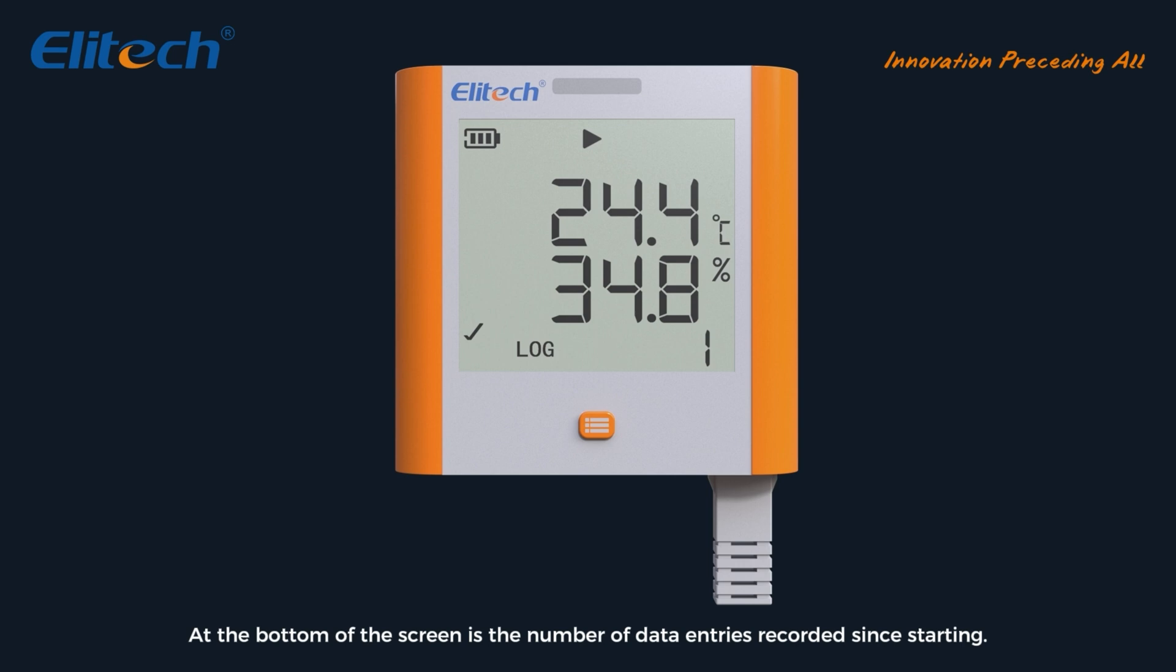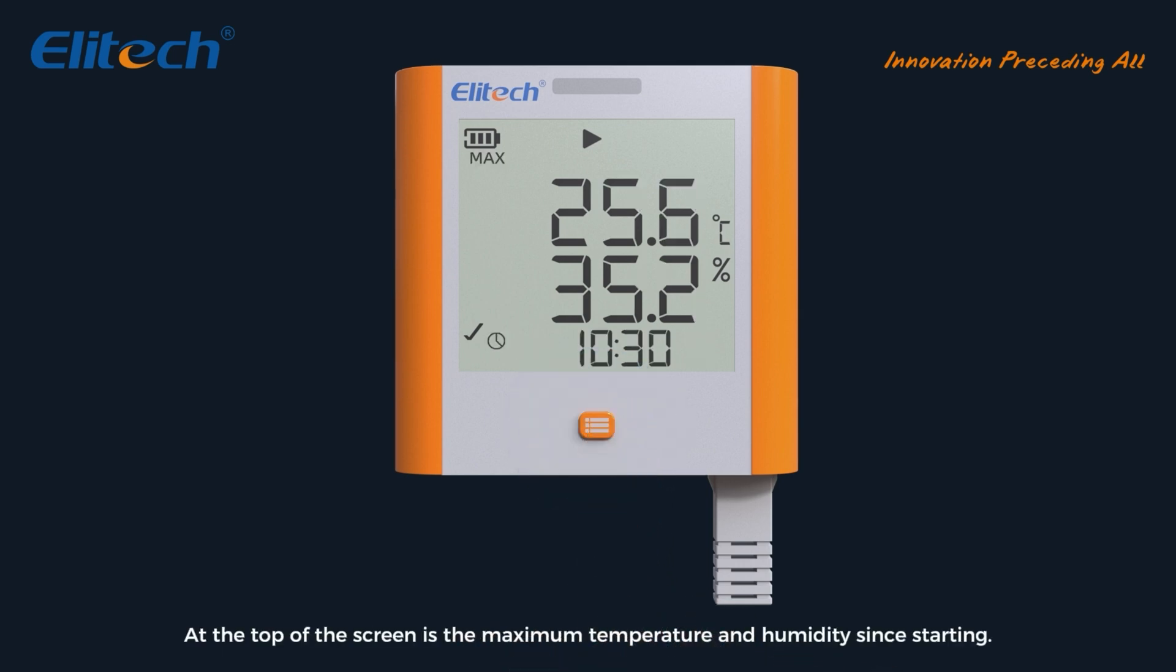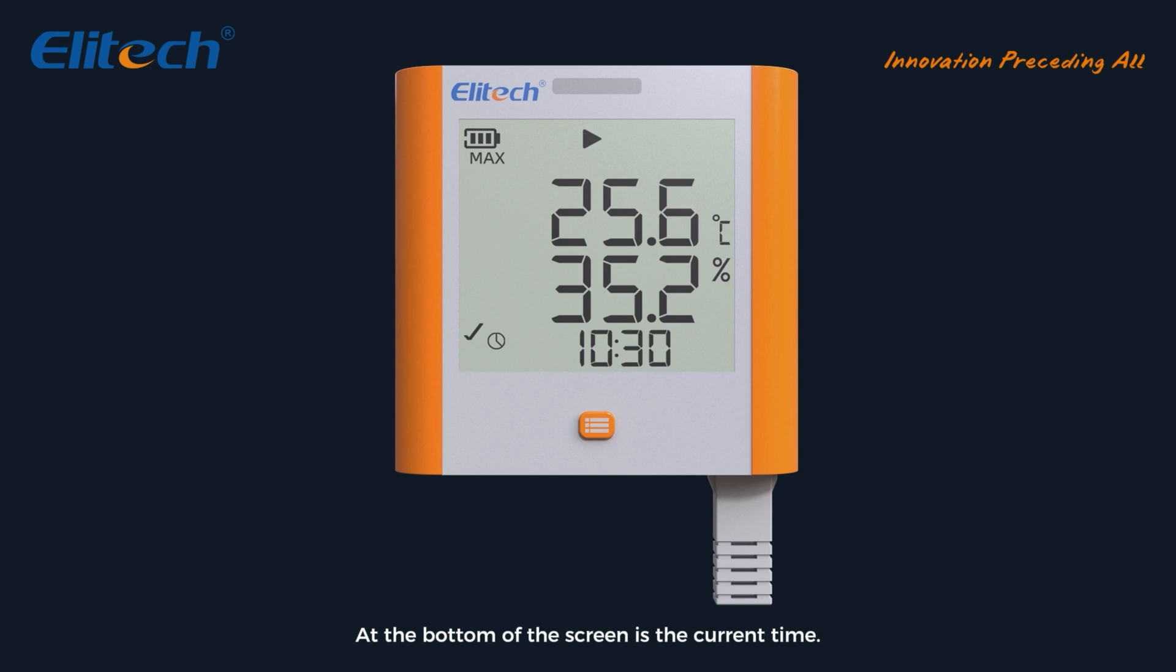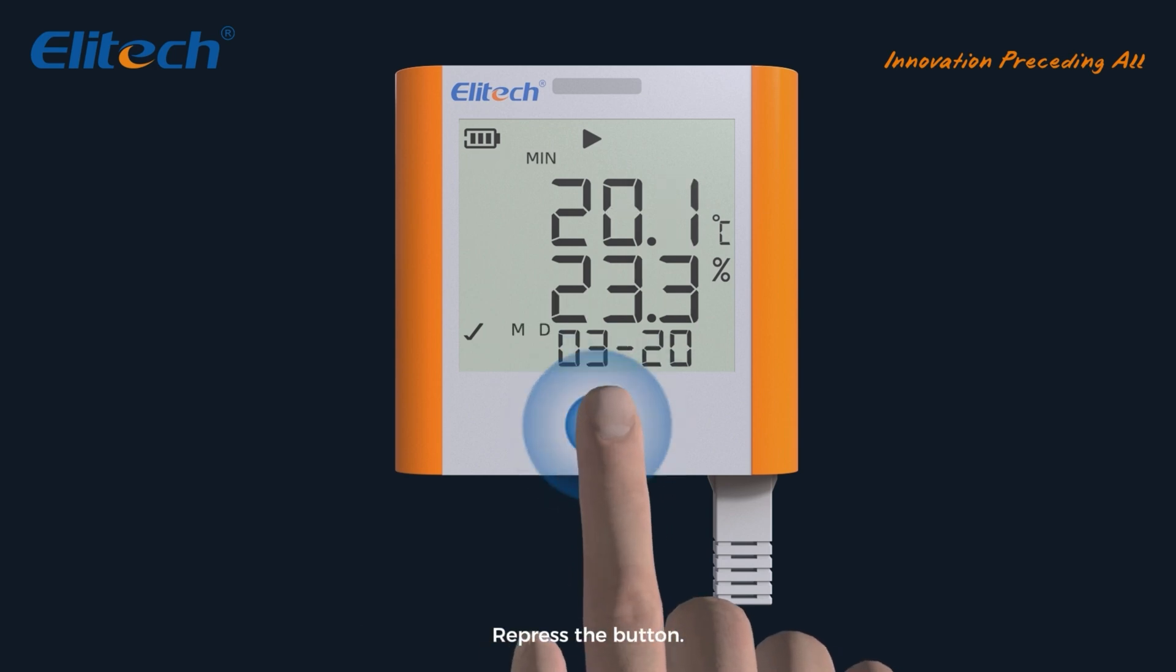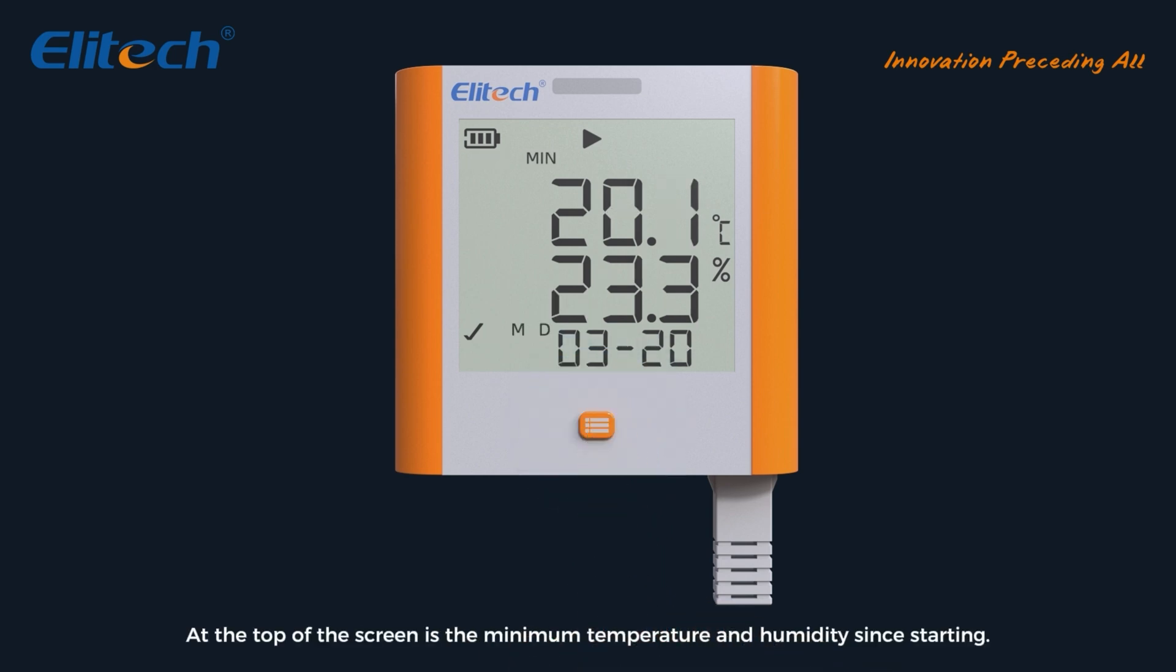Short press of button: at the top of the screen is the maximum temperature and humidity since starting. At the bottom of the screen is the current time.